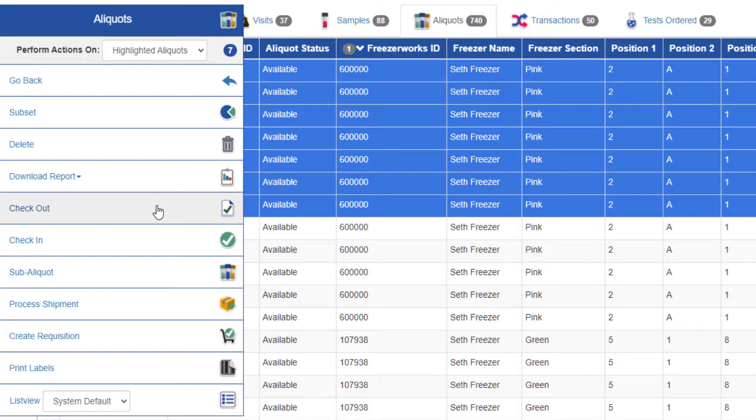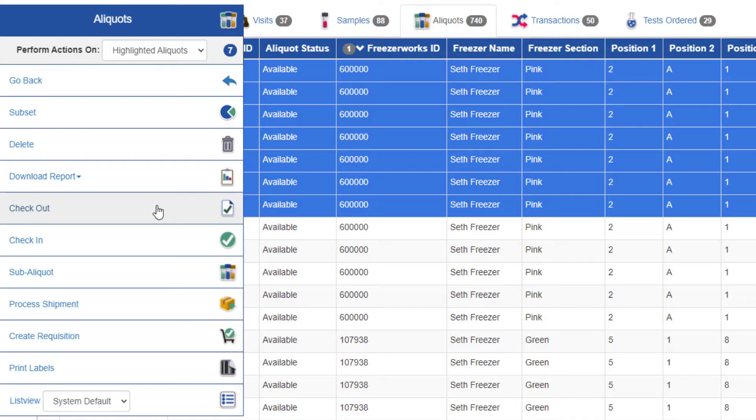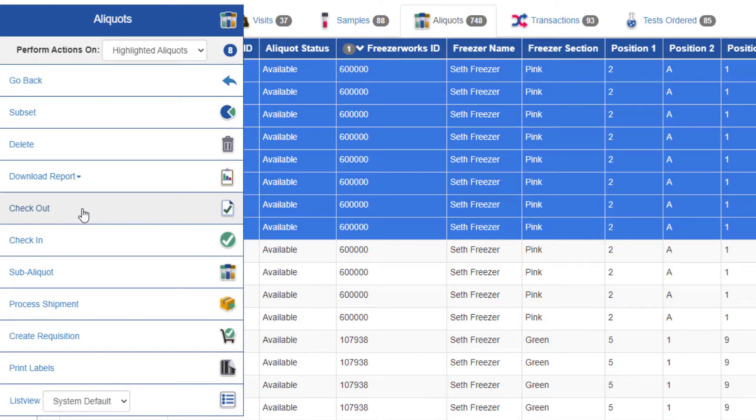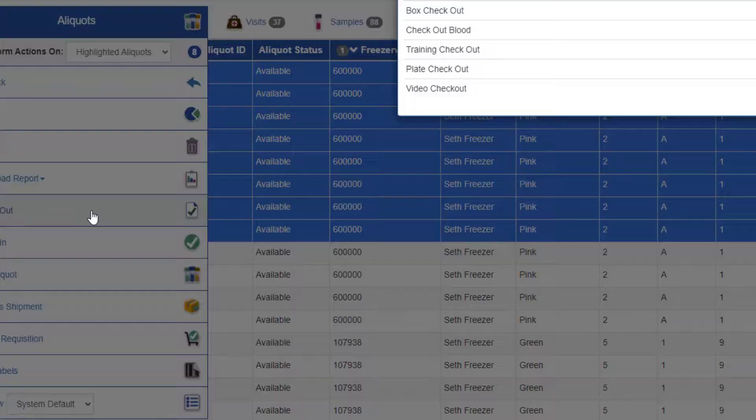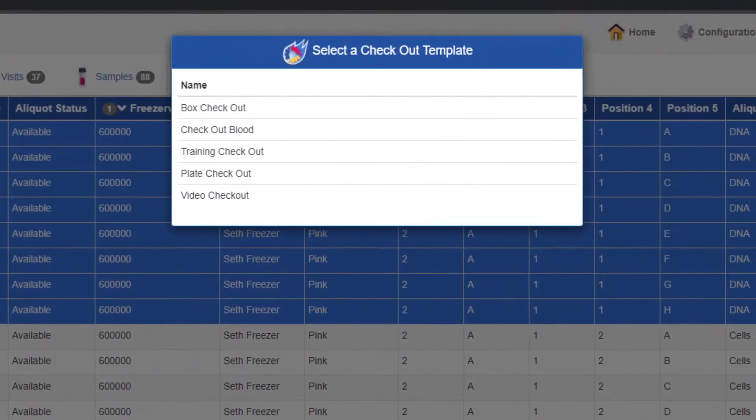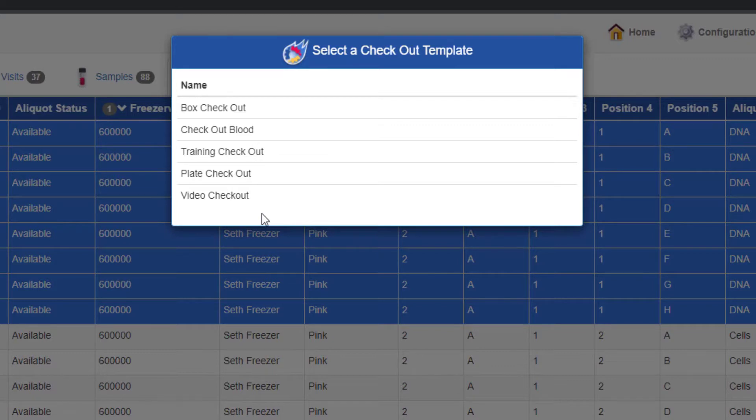A checkout is when you are taking the aliquots out of the freezer for analysis, testing, moving, etc. When you select any of the four buttons, a list of available templates for the workflow type you chose will appear. I chose checkout, so here are the checkout templates assigned to my group.